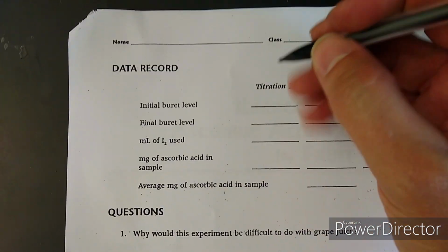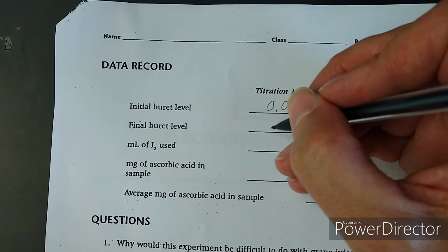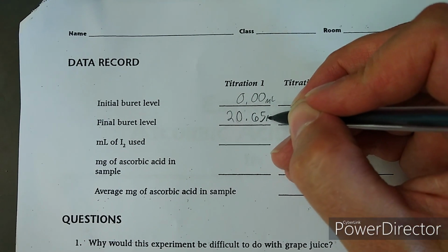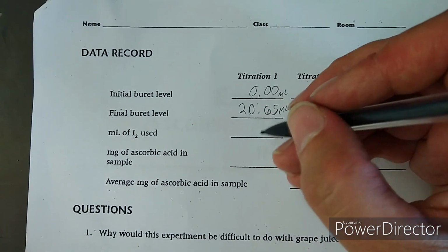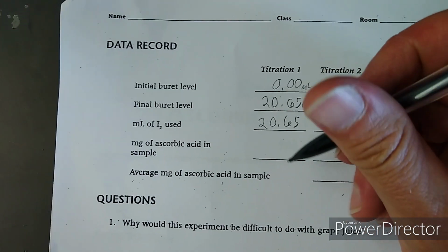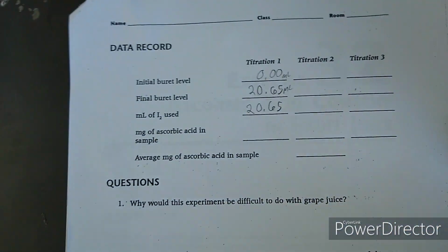Alright, let's record it on our data record here. Initial burette level was 0.00 milliliters. Final burette level is 20.65 milliliters. So milliliters of iodine used, it's just 20.65 minus 0, 20.65. Okay, and we'll calculate milligrams of ascorbic acid in the sample by multiplying this by 0.53. So let's try that out here.